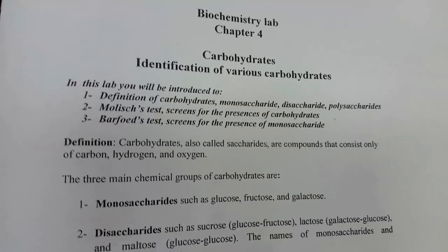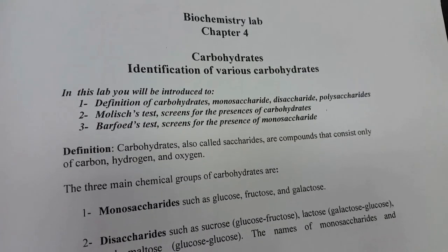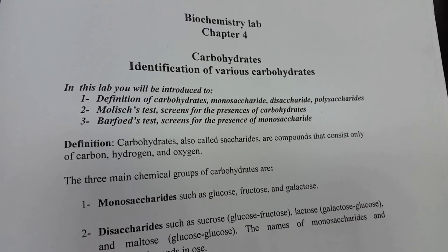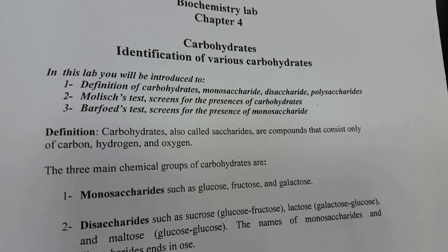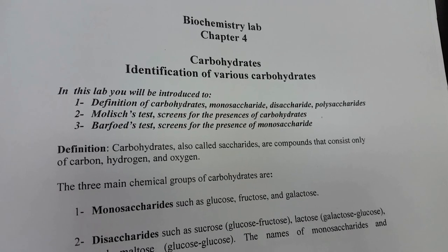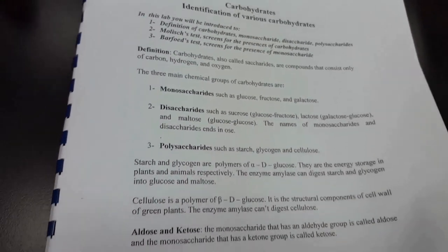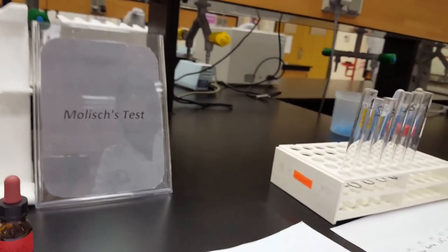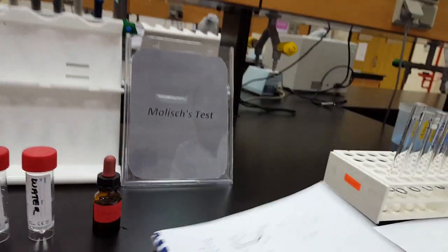Assalamu alaikum. Welcome everyone. So this week's lab is about the identification of various carbohydrates. Dr. Matkur has already explained the theory part, so this is the practical part for today. We are going to test for the monosaccharide, disaccharide, and polysaccharide using different reagents. We will start with the first experiment using the Molish test.